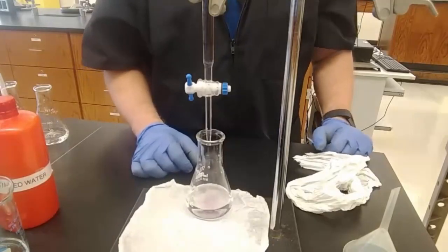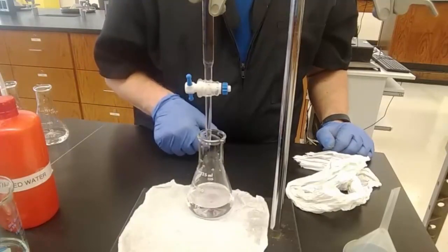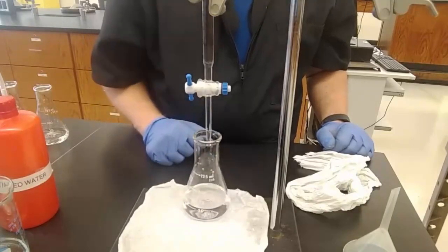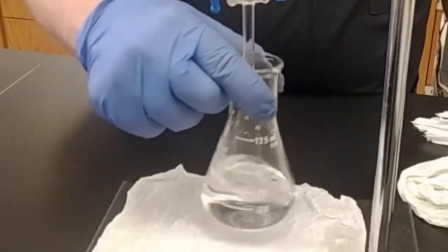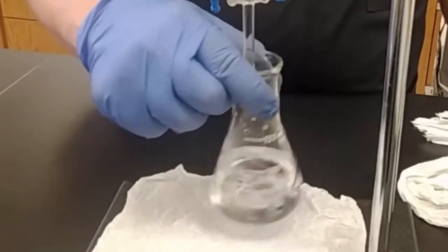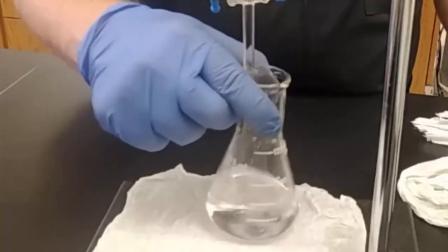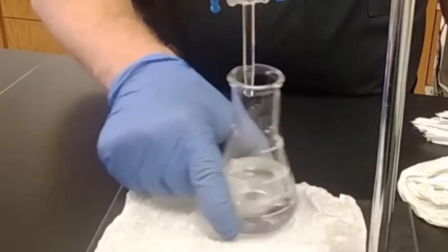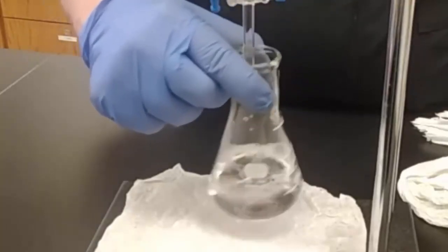Again, patience is required here. It's staying pink a little bit longer, but notice when I swirl, it goes away. We are at 14 now, which means we've added 11 milliliters. Our goal is the lightest shade of pink possible, thus the white paper, that persists. Maybe you won't get it the first time. That's why we're doing it the second time and the third time. It stays pink a little bit longer as I swirl it, but it's not staying pink.